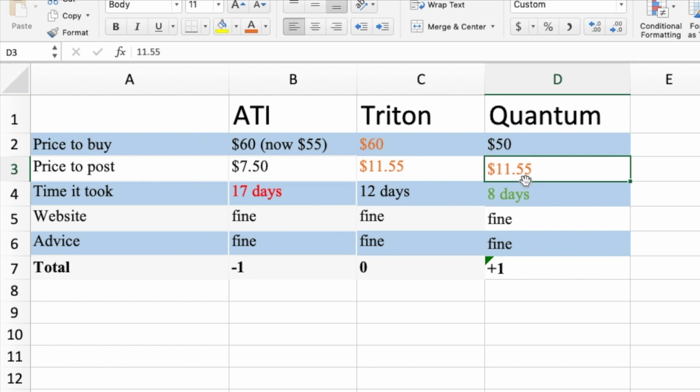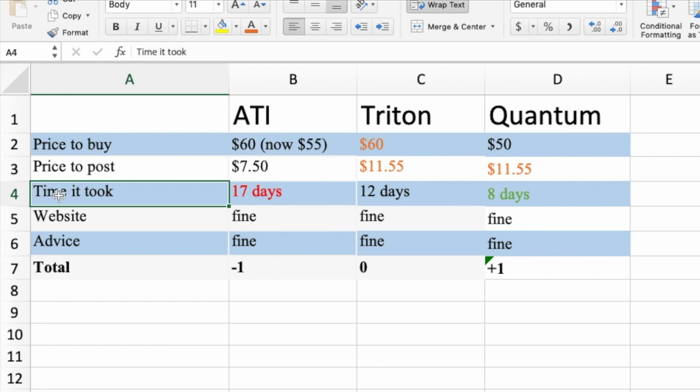No big deal. All right, this next row is one that people do often care a bit about. It doesn't bother me so much. I've waited 4 or 5 weeks for a result before. I gave the MarinLab one 6 weeks before following up on it, but elements aren't going to leave your water. They're all going to be there, so it honestly doesn't bother me, and I'm not testing for something that I need to know that's in the water there that day so I can act on it. I'm looking for a trend of heavy metals or pollutants getting in my water that I don't want. But that being said, it is a vital thing that we need to compare.